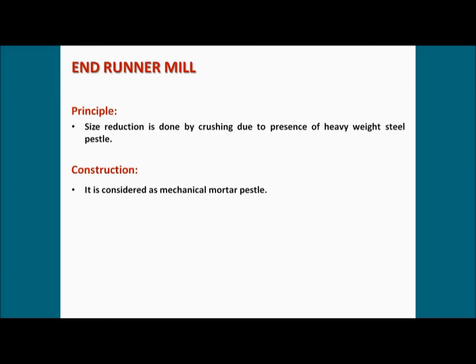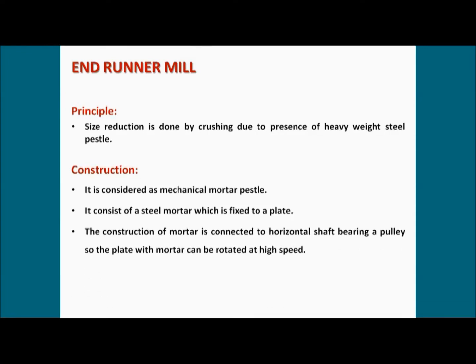The end runner mill is also known as a mechanical mortar and pestle, where you need not use your hand, right? It consists of a steel mortar which is fixed to a plate, right? The mortar is connected to a horizontal shaft bearing a pulley, so the plate of the mortar can be rotated at high speed. I will show you.